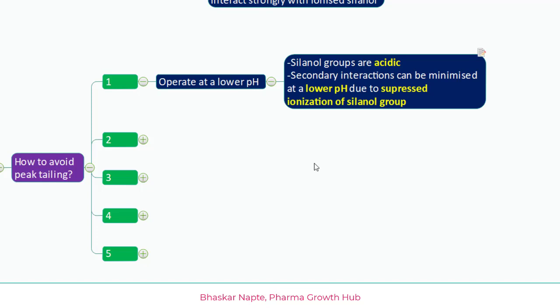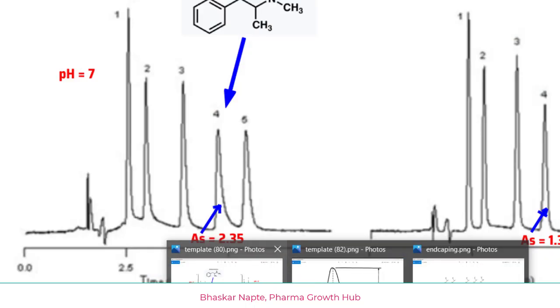The silanol groups are acidic in nature, and secondary interaction is possible because of the ionization of silanol groups. To minimize and suppress the ionization of silanol groups (SiOH), you maintain an acidic pH — in an acidic environment these silanol groups will not undergo ionization. So the straightforward solution is to maintain the mobile phase pH on the acidic side.